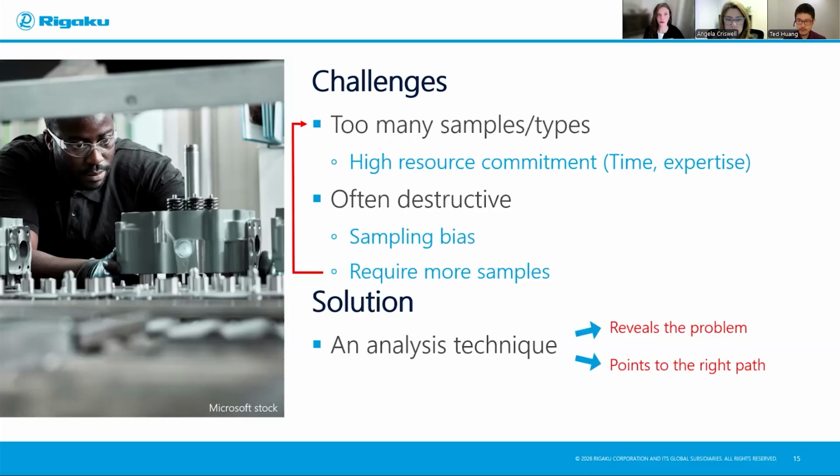And to do that, this technique has to have a couple of qualities, because we already established this is a multi-scale issue. That technique has to have a wider scale range of observation. And also, it has to be non-destructive, or at least minimally destructive when it absolutely requires. It's not like, okay, destructive technique is the default.